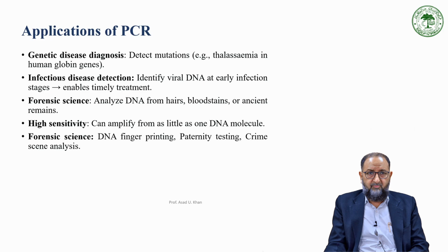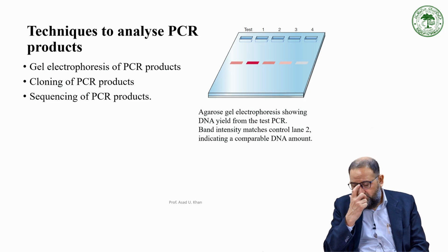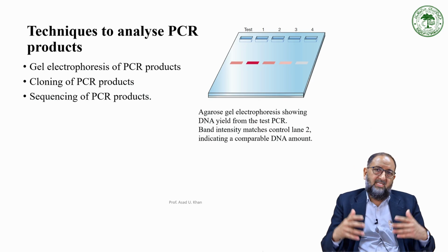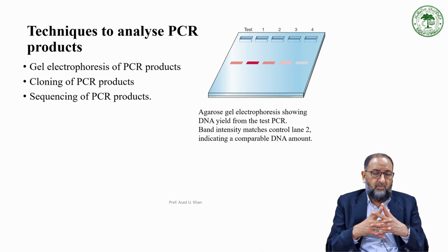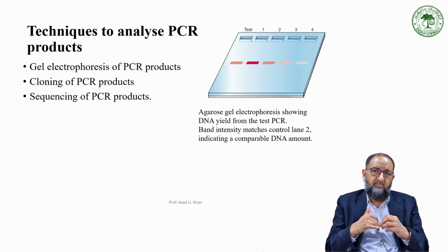So this is the agarose gel electrophoresis, where the gel is being run. Say tests, then 1, 2, 3. You should always have a positive and negative control. The positive control gives you the idea that the gene is present at the same size, same place, same location, and the negative control will tell you whether you have something wrong, and whether your reaction is working well.